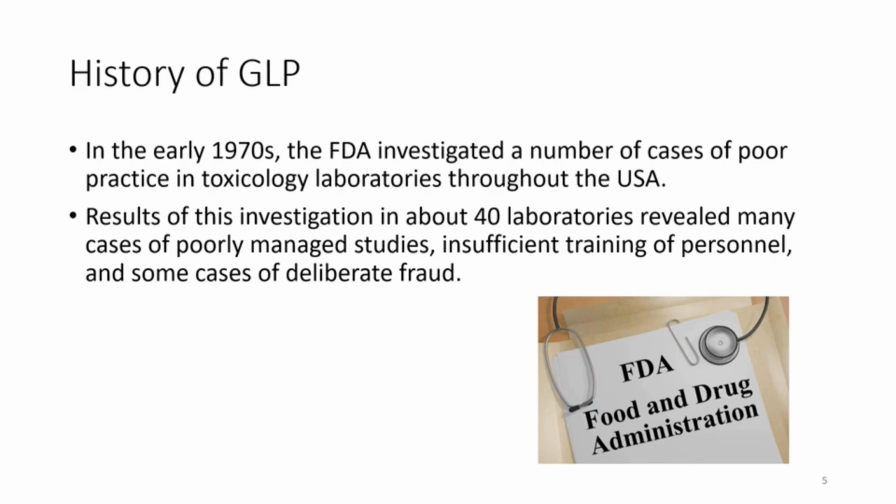For example, the data reported were inaccurate or missing, and there were even studies being reported but were never carried out. The result of this investigation caused some companies to be closed down and some of the management staff to be imprisoned. And the FDA concluded that there was a need to establish a quality management system for the laboratories.